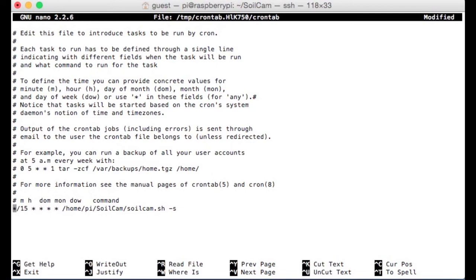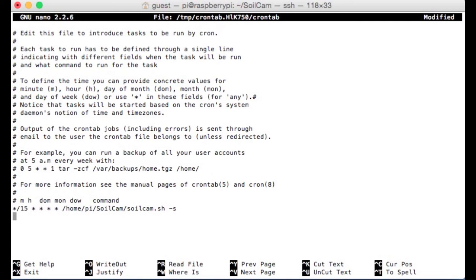That first asterisk is in reference to minutes, this one hours, day of the month, month, and then day of the week. So I want my scanner to initiate a scan every 15 minutes. So if I do star forward slash 15, every 15 minutes, every day, night or day, it's going to initiate a scan.